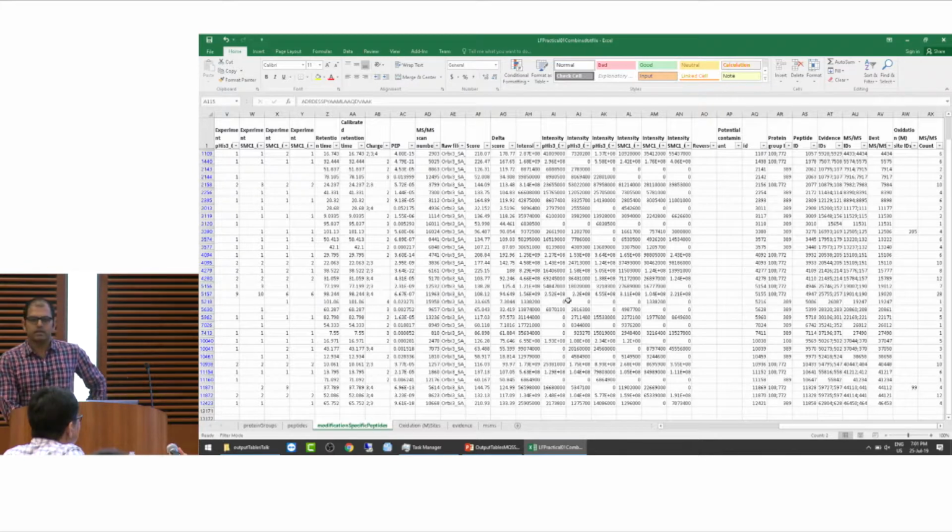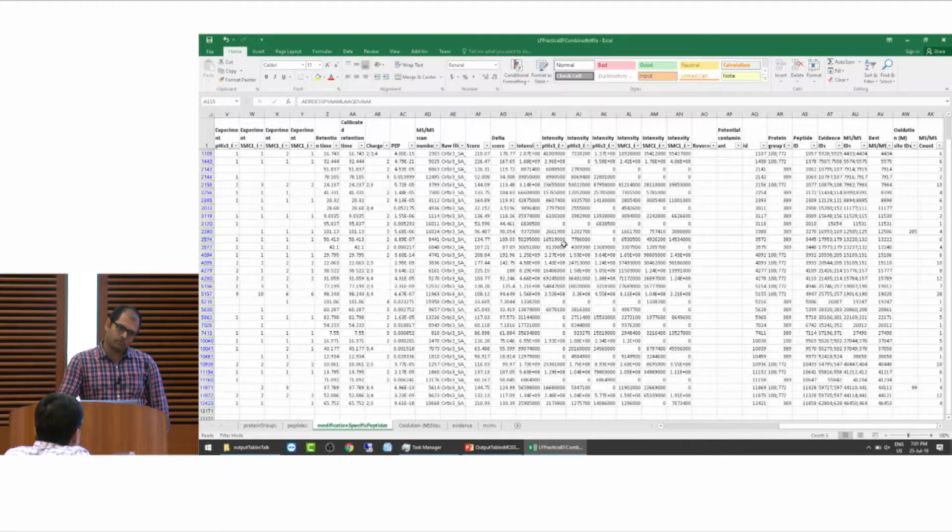Yes, I have a question about what exactly the intensity for the precursor is. I've always assumed that this is the integrated precursor ion area, but in the table's description it says intensity. It doesn't confirm that, so I just wanted to be sure what that column is. I think it's the peak intensity, right? It's the peak intensity of that particular precursor in that particular scan.